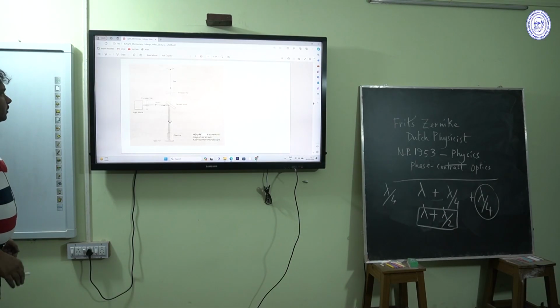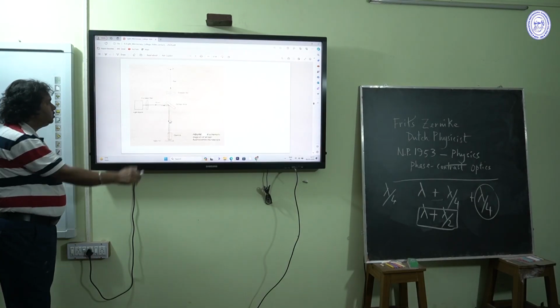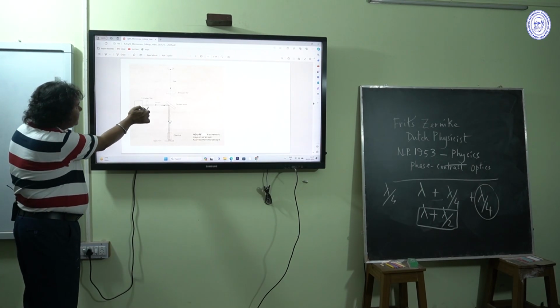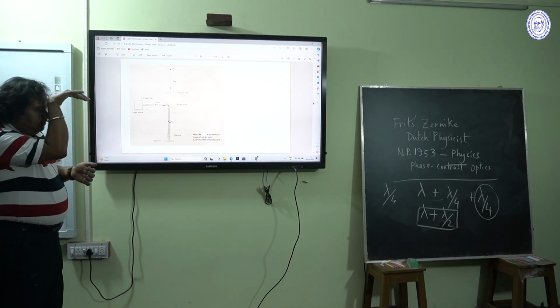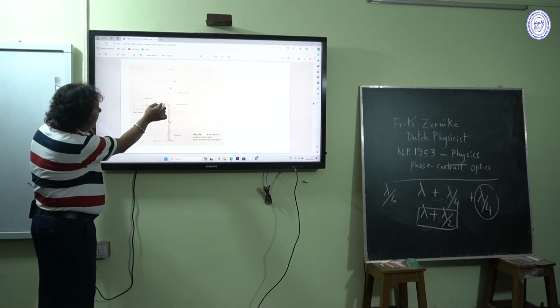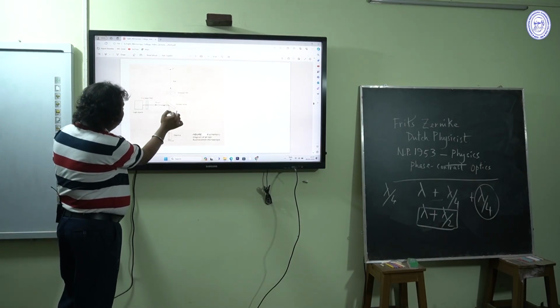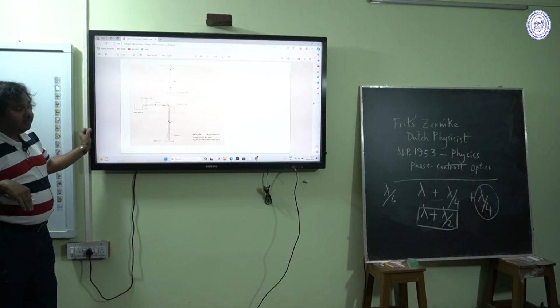This is the basic pathway of the fluorescent microscope. Here this is the light source. Generally, a tungsten bulb is used as the source of illumination, and here is the excitation filter that filters the required wavelength of light. Here the green light is able to pass, and other light is not passing, and it then strikes the dichroic mirror. This is a special type of mirror.